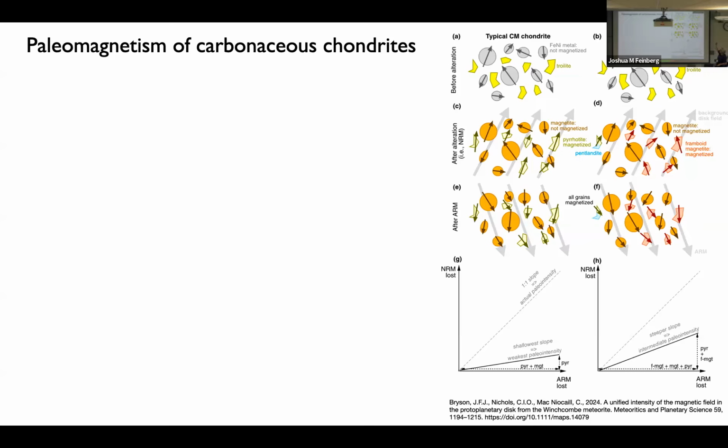here. So the framboid magnetite forms by precipitation from the pyrrhotite that is dissolved, and then you precipitate magnetite. So it may be magnetized, okay? It's not inheriting anything. So on the right-hand side, you've got a situation where you've got two different types of magnetite, one which is not magnetized in the bulk and one that is, right? And so two different forms of the same mineral, but carrying different paleomagnetic signatures, okay? And you've also maybe got pyrrhotite and pentlandite in there carrying other signals.